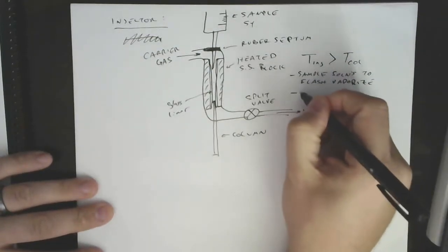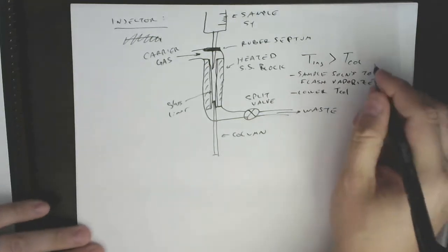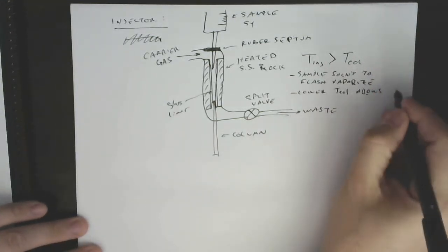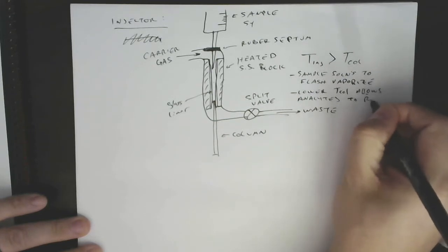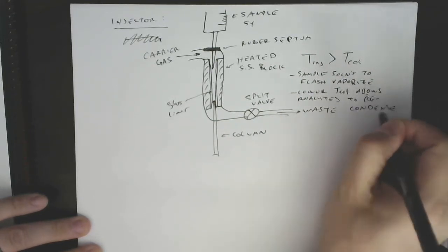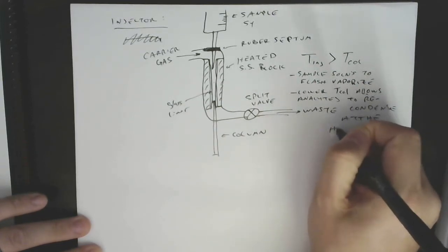But the lower column temp allows analytes to re-condense at the head of the column.